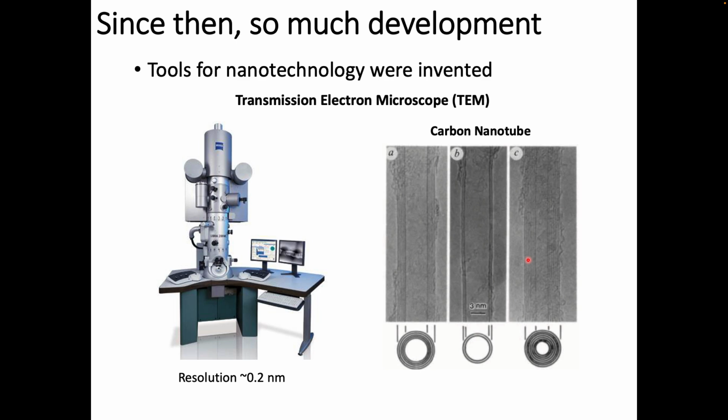There are multiple types of carbon nanotube. You can distinguish between single-wall carbon nanotubes and multi-wall carbon nanotubes. Obviously here all of them are multi-walled, but this particular one has only two walls, right? It is quite small; if you look at the dimension, it is only about 3 nanometers.